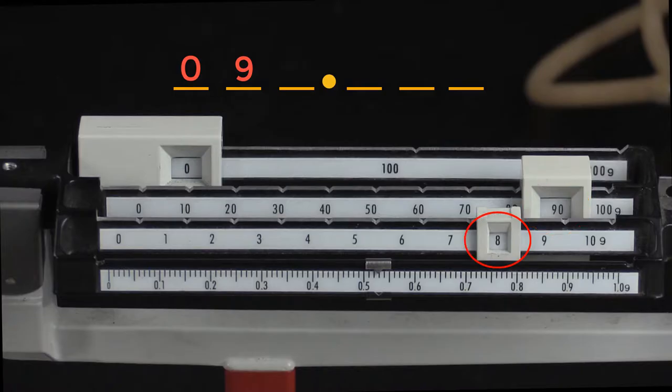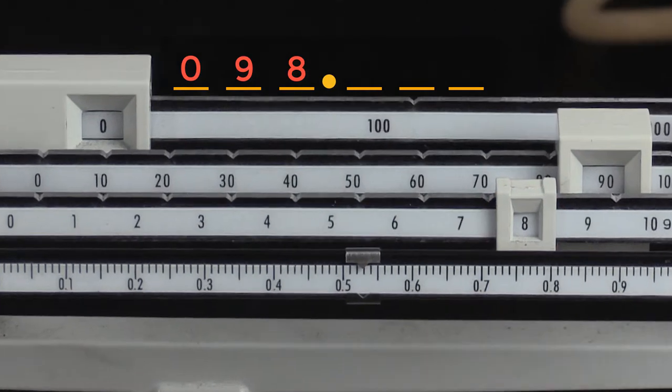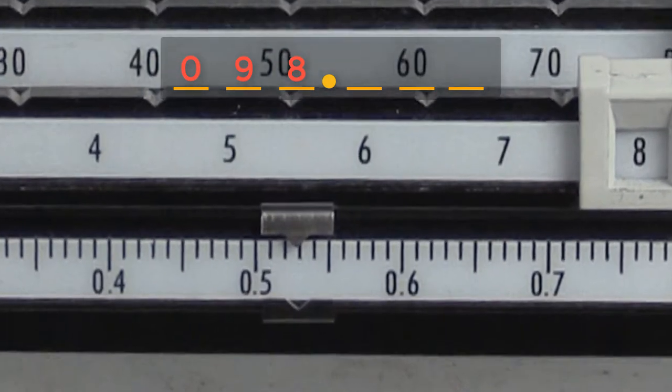We do the same for the ones place beam, and we see that it is in the eight slot. So we put an eight in the ones place for our measurement. Now for the decimal places.